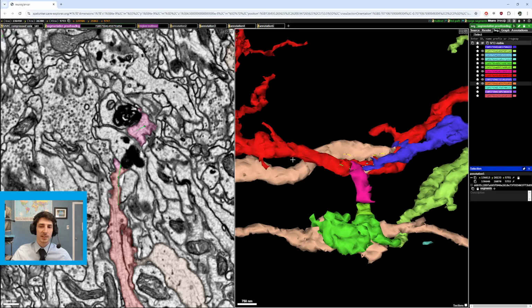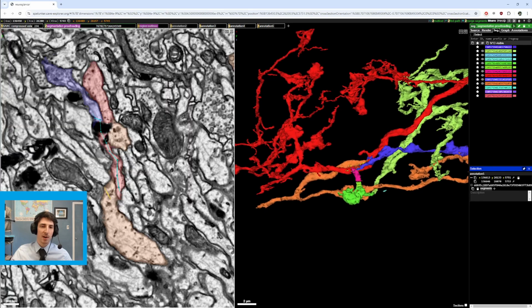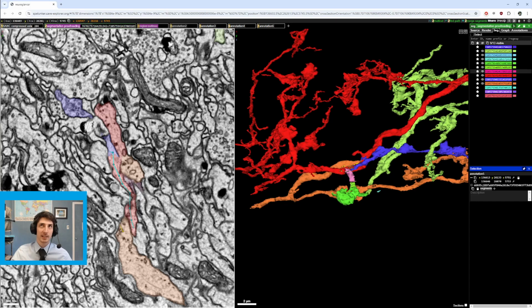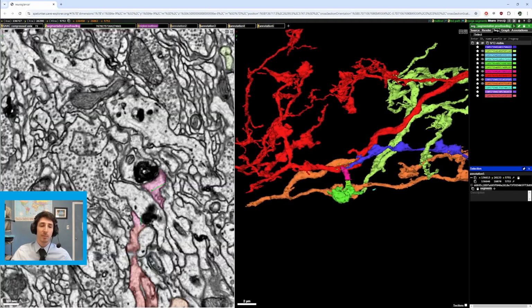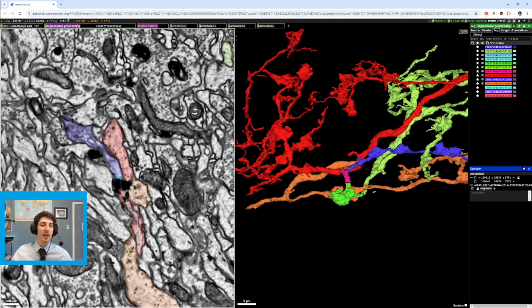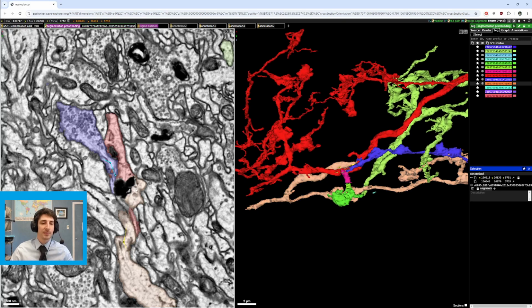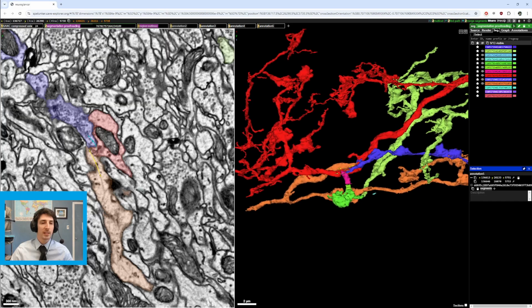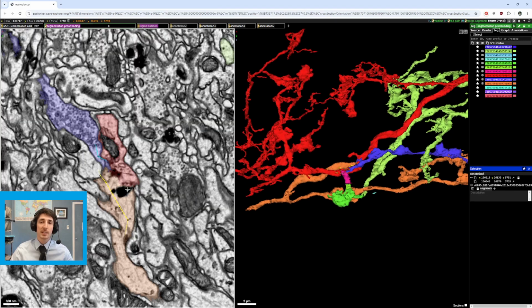And that helps us to make sense of the merger thus far, because the red splitting into two things is already crazy, but splitting it into three is even crazier. So we solve those paths with three different point pair paths, three different colors, and by using these color-coded paths, we are able to create a way to solve these troubled, damaged areas in a systematic way.